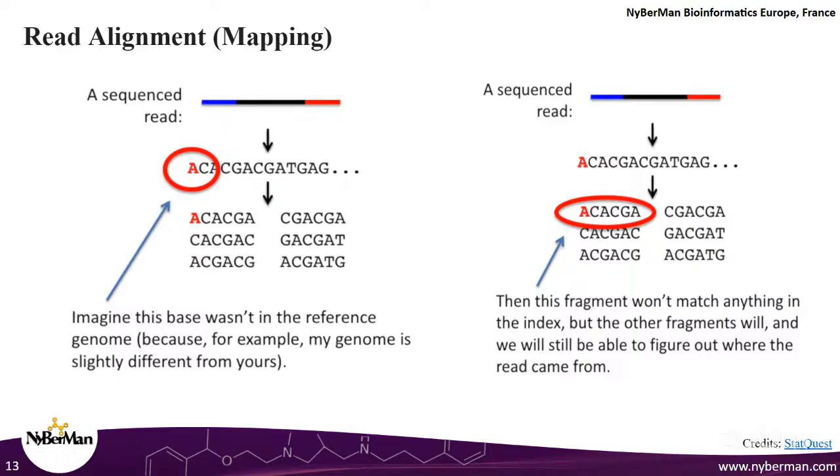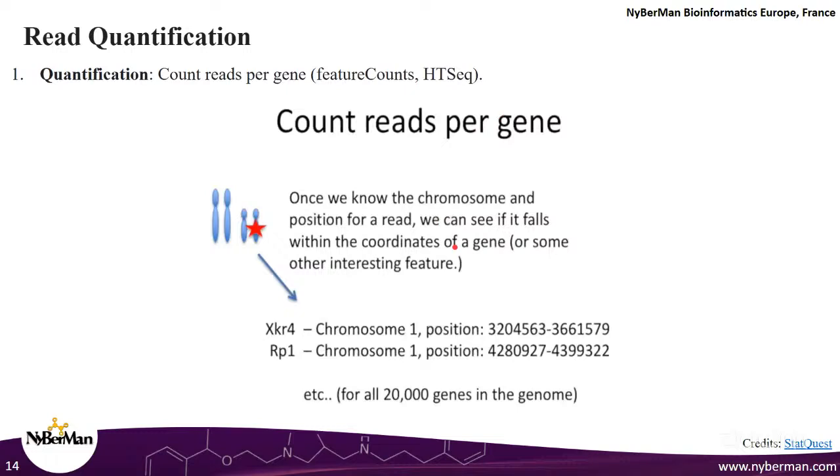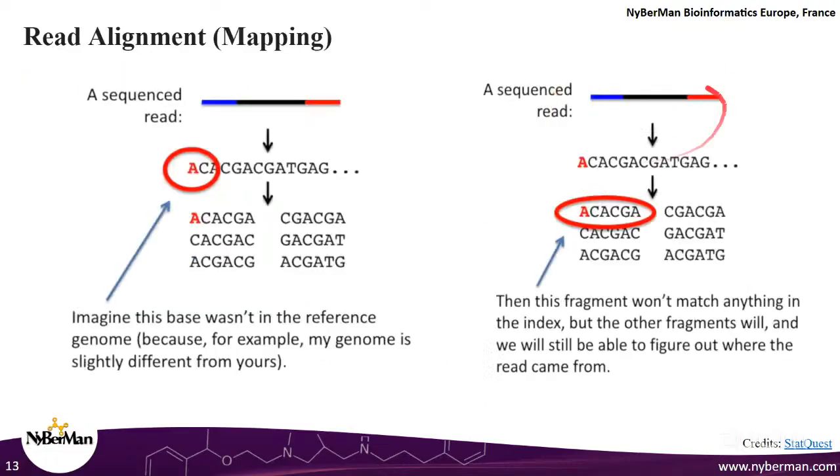Now each read is assigned positions, that this sequencing read has mapped to, for example, position number 101 to position number 202. So a region of around 101 bases. We have positions starting from position 1 till position 3 billion.